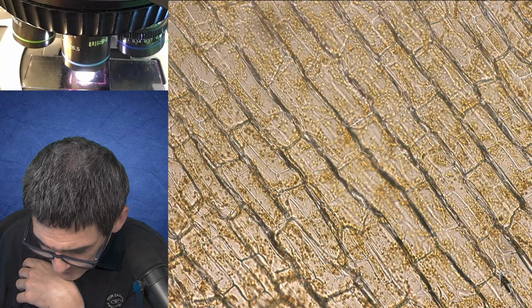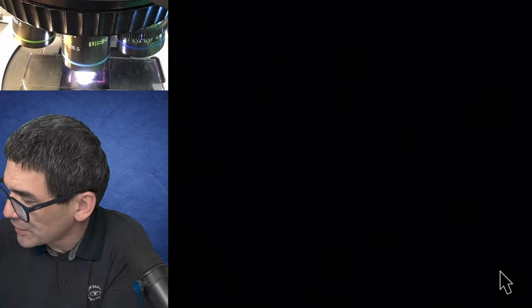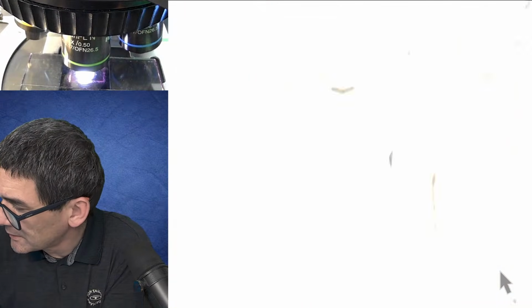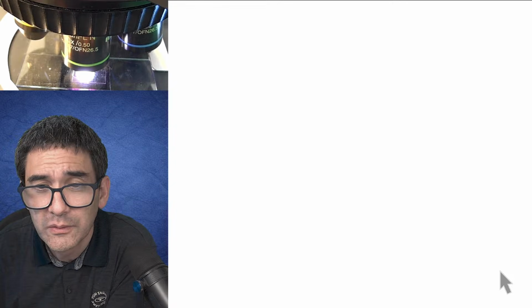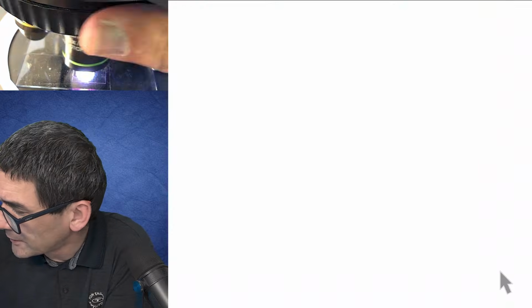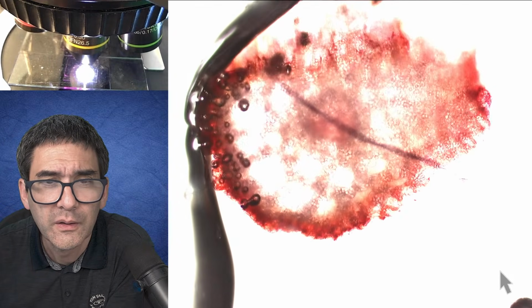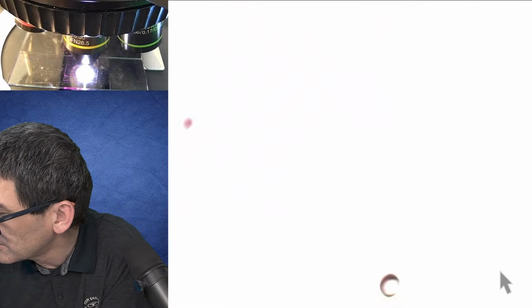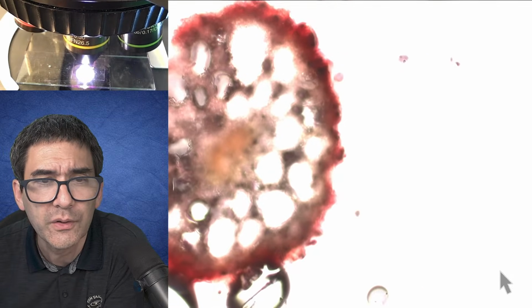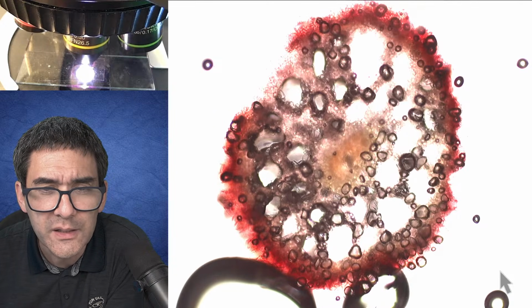Over here, what is this here? The cross sections of the water plant, the stem cross section. Let's find those. You always start with a low magnification. Here we go. What's this? The stem cross section? Let's try to find another one over here. This one over here. And maybe you notice something else.